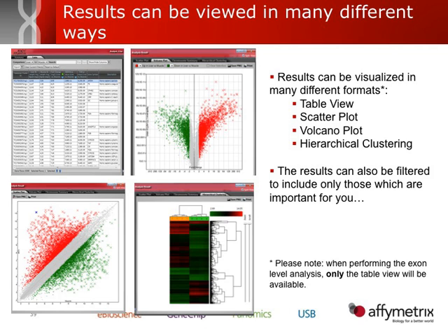So essentially we're looking at signal of one condition on the x-axis versus the signal of the second condition on the y-axis. So what we'd want to look for in a typical study where we're looking for differential expression between two conditions is we want to see things that are very highly expressed in one condition but not very highly expressed in the other condition. So things that might be in the upper left corner or in the lower right corner of these scatter plots.